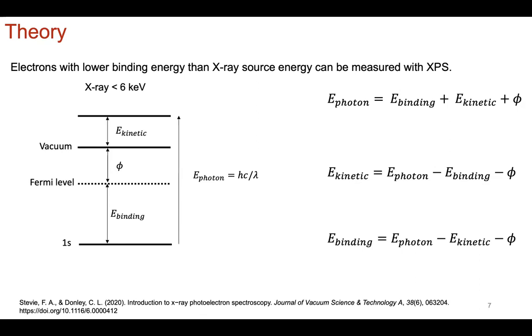Then the peak fitting has to be done with a lot of care, and you would sample a lot of points in your sample to make sure you're not overfitting. The other thing is operationally, the full width half maximum. You can't just willy-nilly say, fit a Gaussian or a pseudo-Voigt and whatever I get is whatever I get. There has to be some constraint, and you can base those constraints empirically off similar spectra or similar samples.